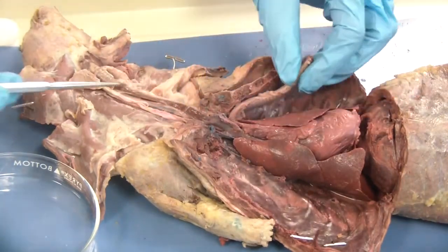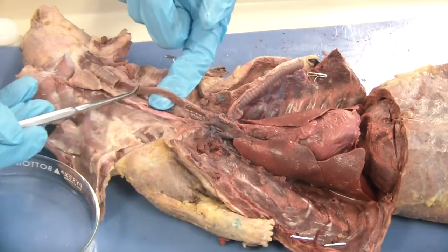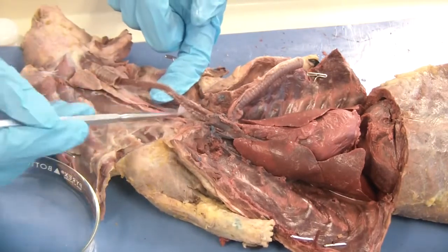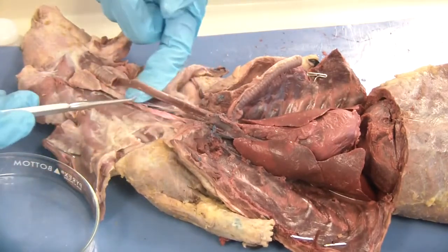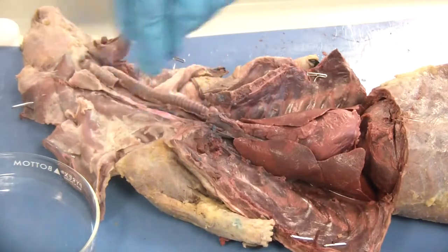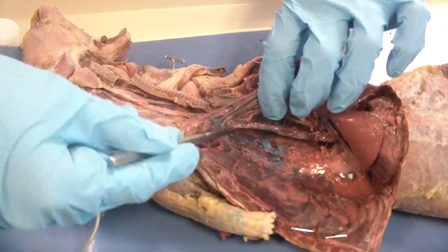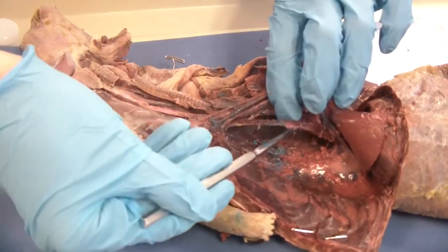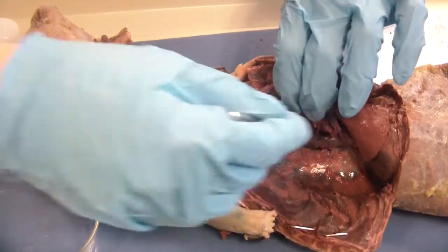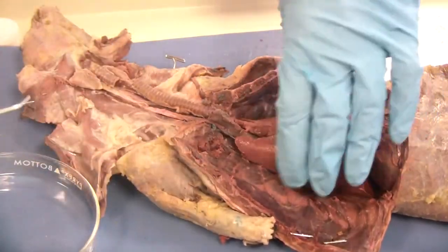The esophagus is going to be back behind the trachea. It is this smooth flat tube of muscle — and yes, it is a tube. Food can pass through that tube on down into the stomach, but right now there is nothing in it so it is flat. Please make sure that you are not damaging the esophagus. We are going to separate it out. The esophagus actually continues to run on down underneath, back behind the lungs, and we are going to separate it all the way down until it passes through into the abdomen.